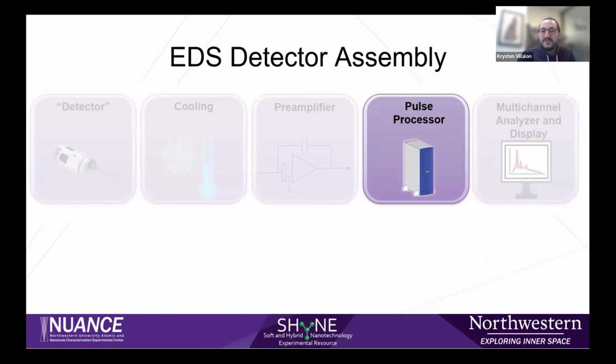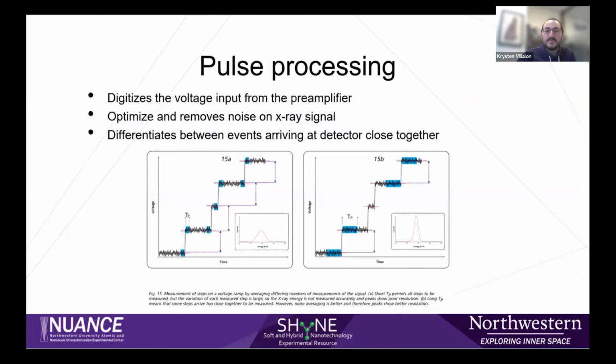And that amplified signal is what the pulse processor reads. Although the first thing it does technically is digitize that voltage signal. But after that, it can then remove the noise coming from the sensor and the electronics and all that. All right, so now there's two phases here. So the processor can either be observing or thinking, right?